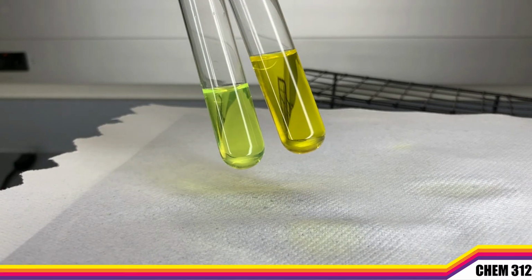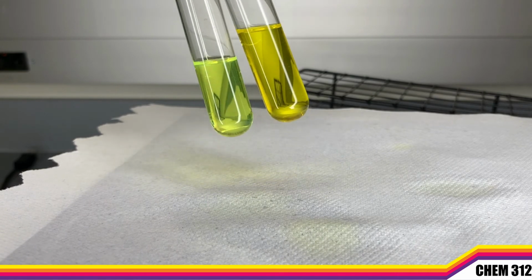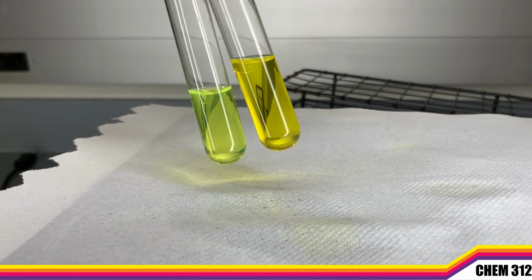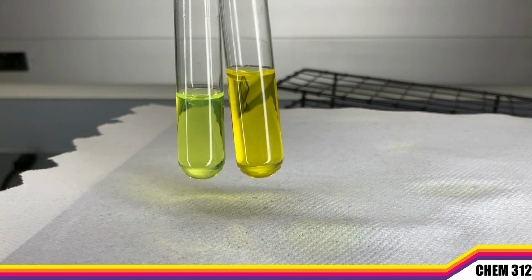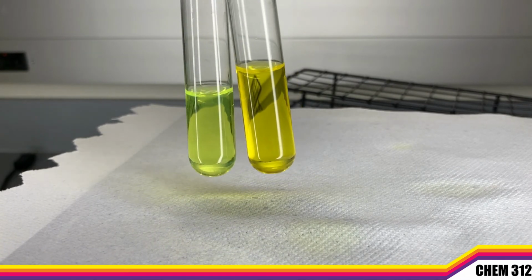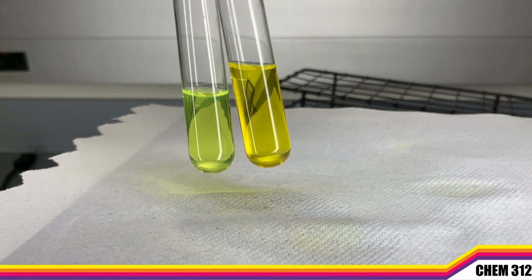So what's an application for this imine? As it turns out, it can actually bind to metal complexes, and some of those are fluorescent. Fluorescence means that a complex is emitting light at a different wavelength than it's absorbing. Here we are under just white light, like normal room light. We can see that these two samples look nearly identical. However, let's turn the light down and shine ultraviolet light on these two samples.